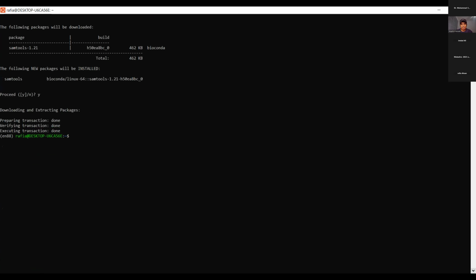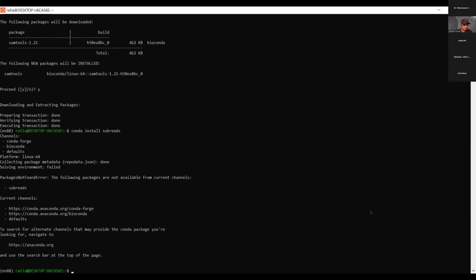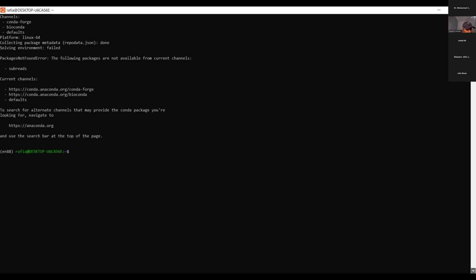Okay. Next, install subread. So the spellings are right? Yes, subread.